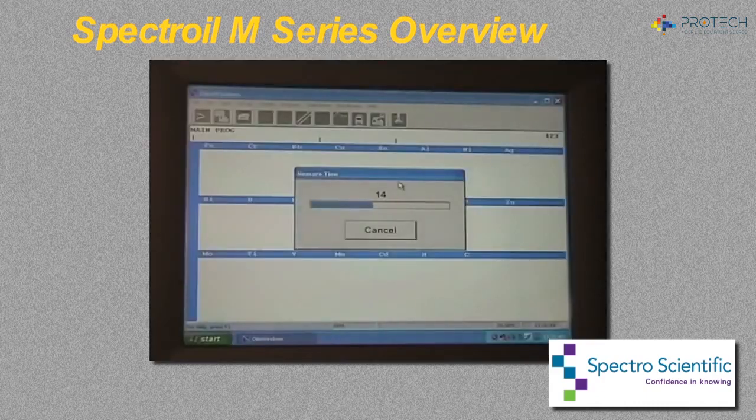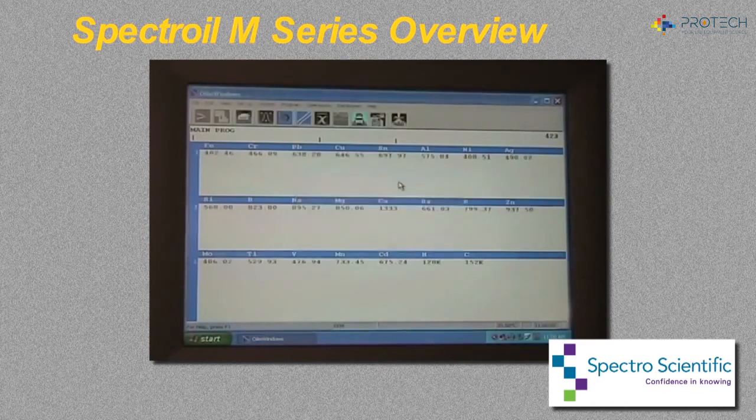The analysis process to obtain the concentration of up to 32 elements simultaneously takes less than 1 minute. The SpectrOil is very simple to operate, does not require any special training or an operator with a technical background, and furthermore does not require the use of any special utility gases, and is always ready to analyze samples.